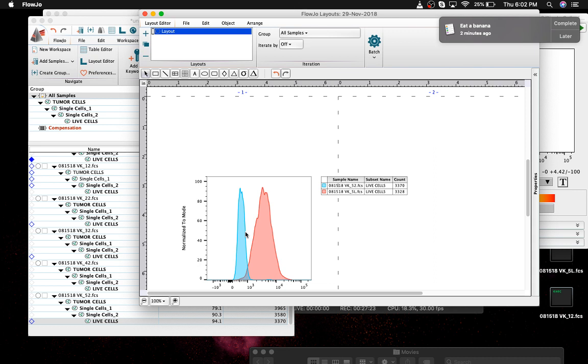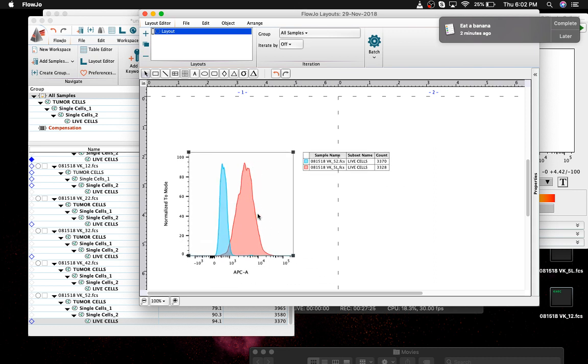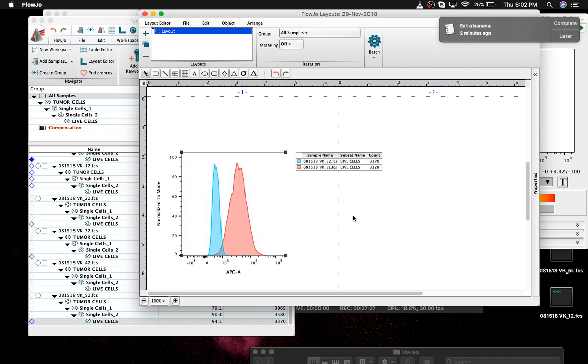I hope I have done a decent job in making you understand how FlowJo works. I wasn't quite sure about the data set that I had, and I was just analyzing it now, and I thought I'd just make a video. So I hope this helps.